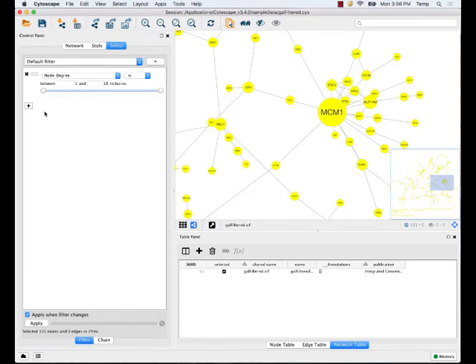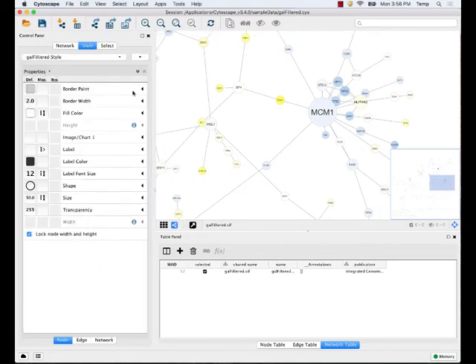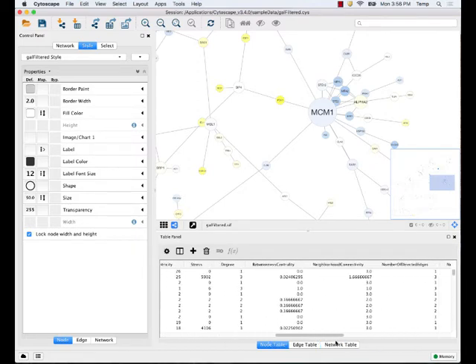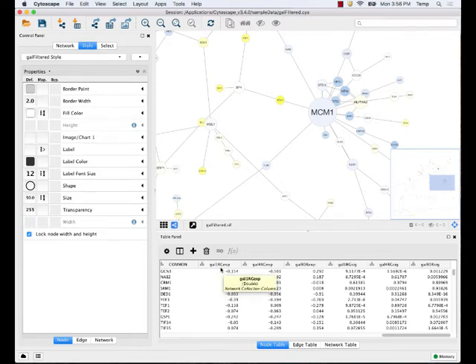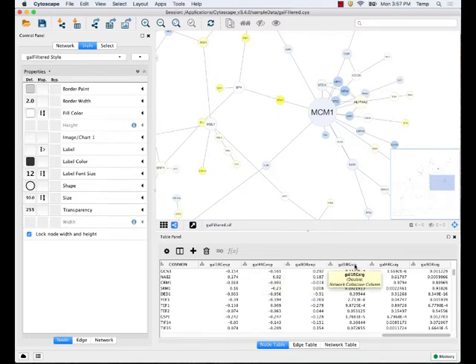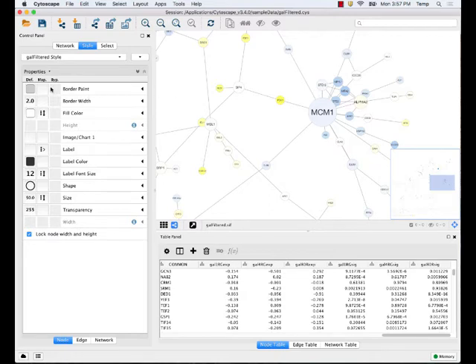You can create any number of filters and make Boolean combinations. Lastly, I wanted to illustrate the Style panel. Any attribute — in this case I have a bunch of gene expression data loaded up, yeast gene expression log2 fold change data from experiments where individual genes were knocked out, capturing expression values and p-values — can be mapped to visual properties.